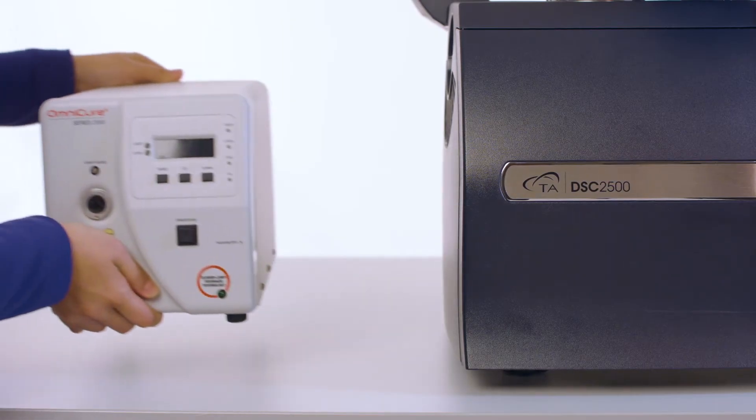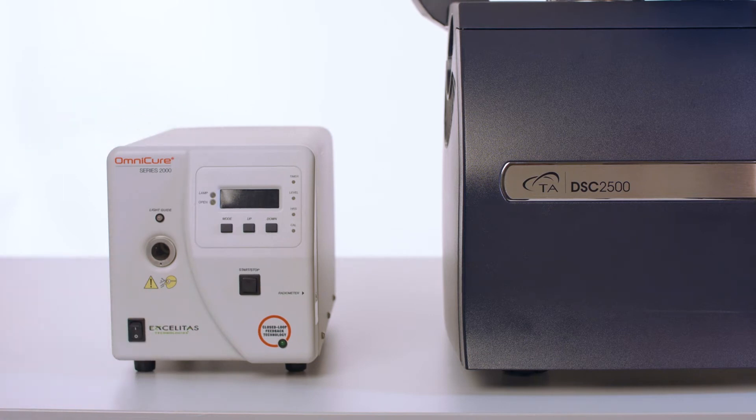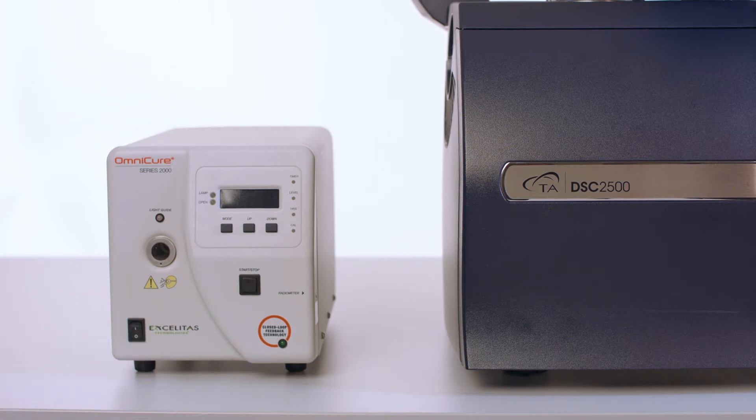Place the PCA unit on the lab bench next to the DSC. Be sure to position the PCA in a way that allows the light guide to be connected between the PCA unit and the cell without putting strain on the light guide.